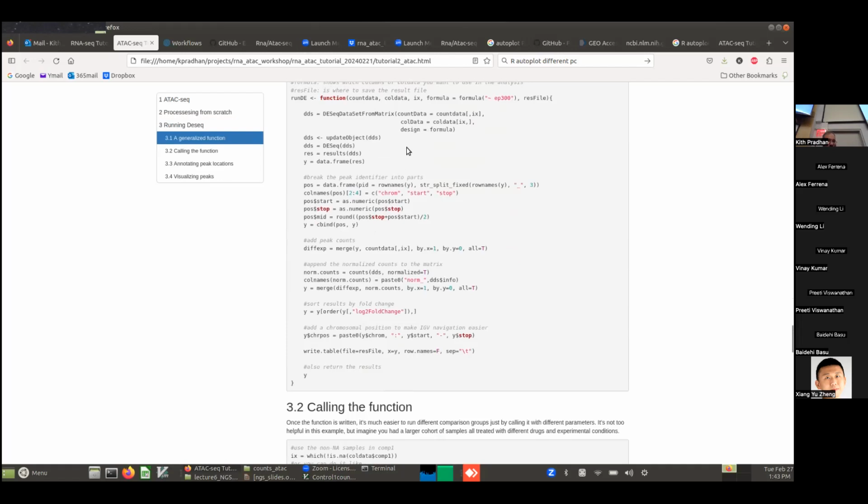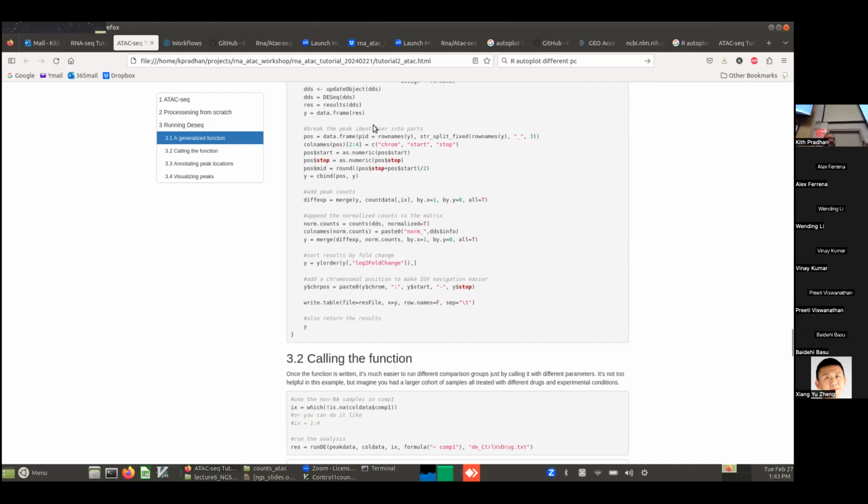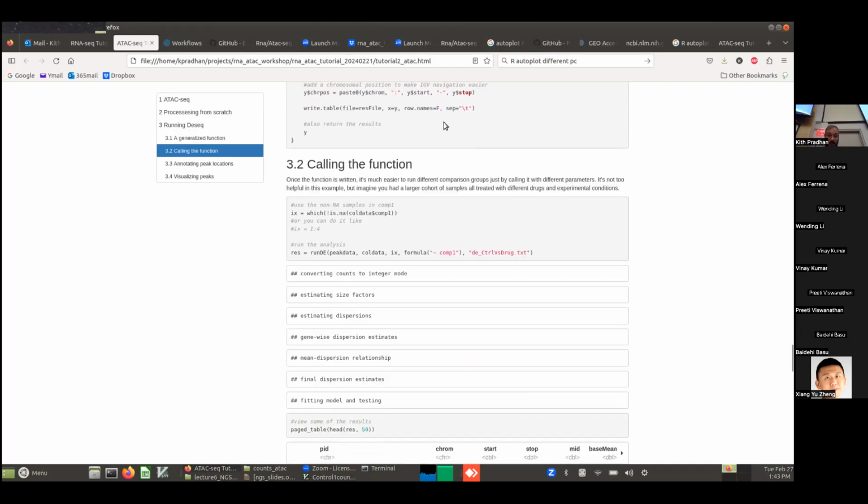You're basically getting all your data into this function. And it's sort of encapsulating an ATACseq analysis and any other thing that you want to add, wrapping it up into a function, and then using the function call to actually do your analysis. So that's what's going on here.